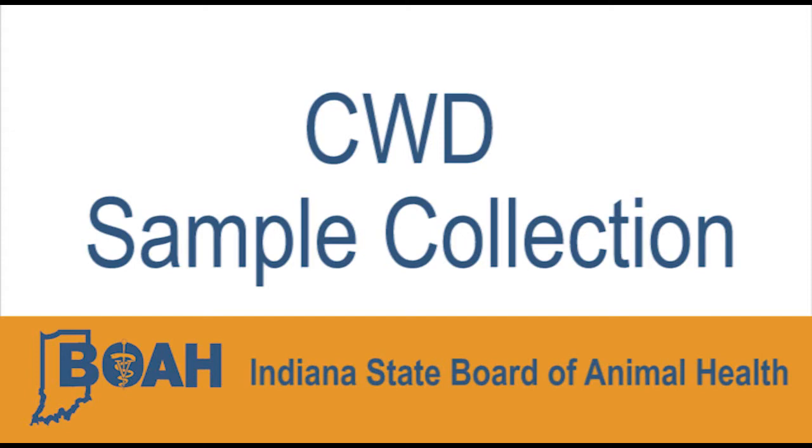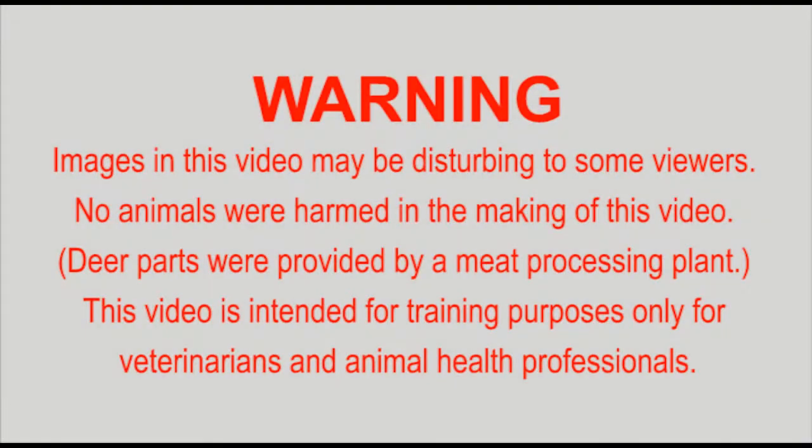Chronic Wasting Disease Sample Collection. Warning: images in this video may be disturbing to some viewers. No animals were harmed in the making of this video. Deer parts were provided by a meat processing plant. This video is intended for training purposes only for veterinarians and animal health professionals.